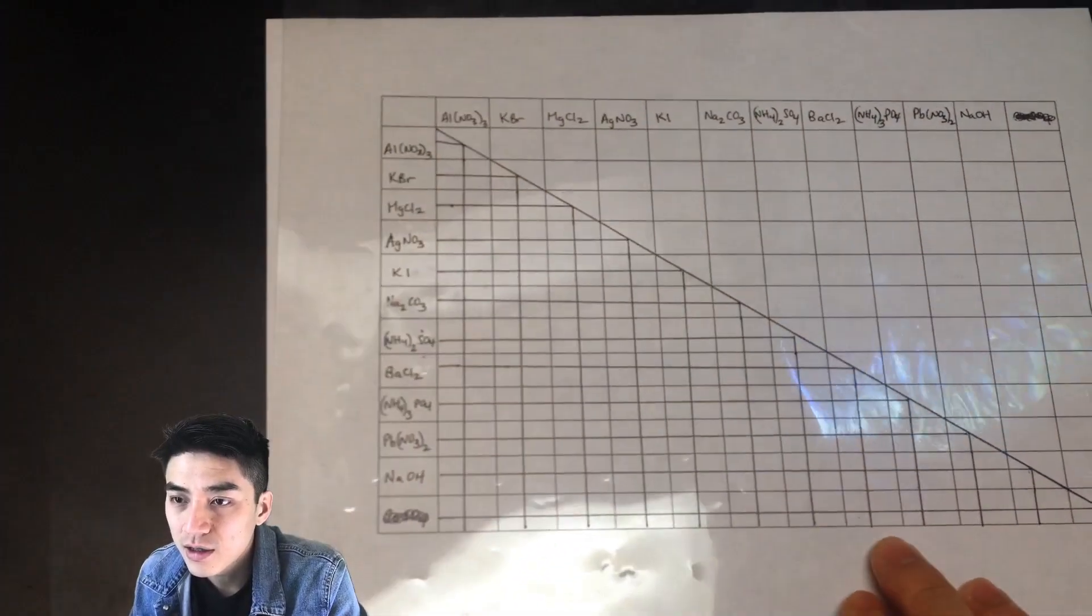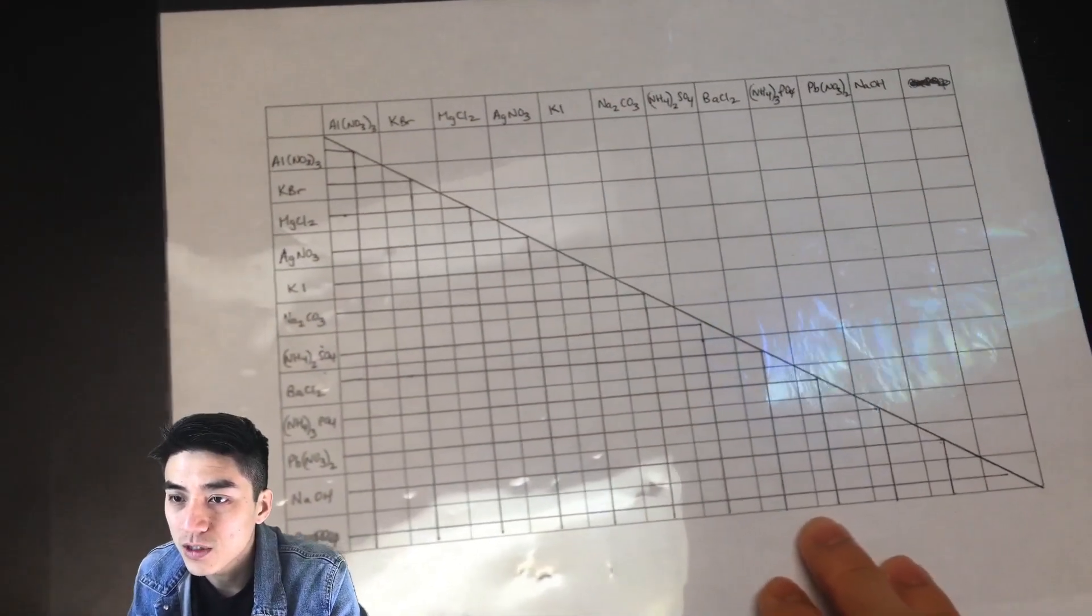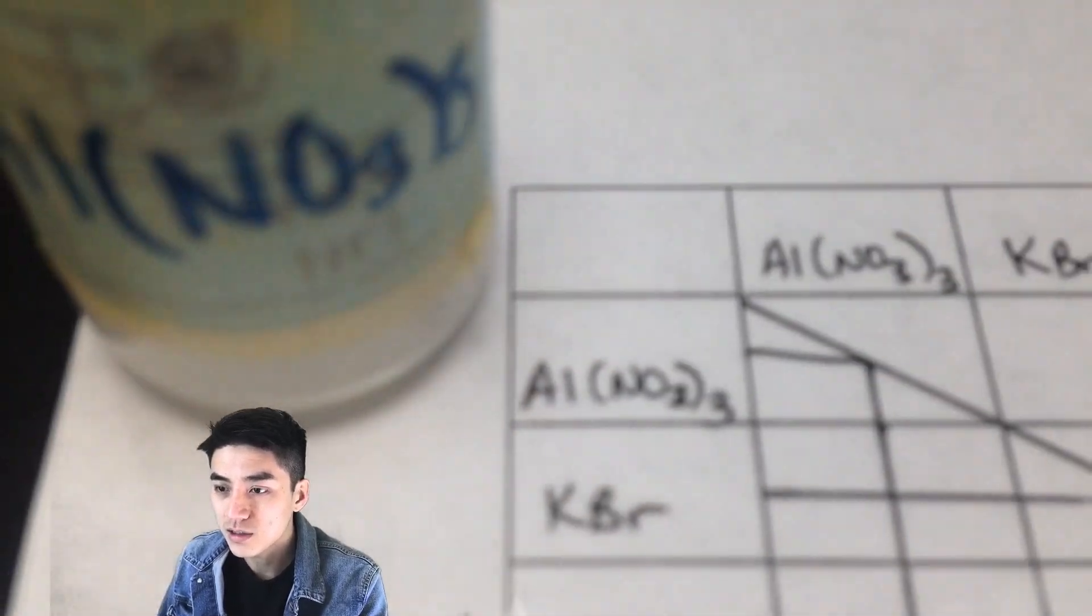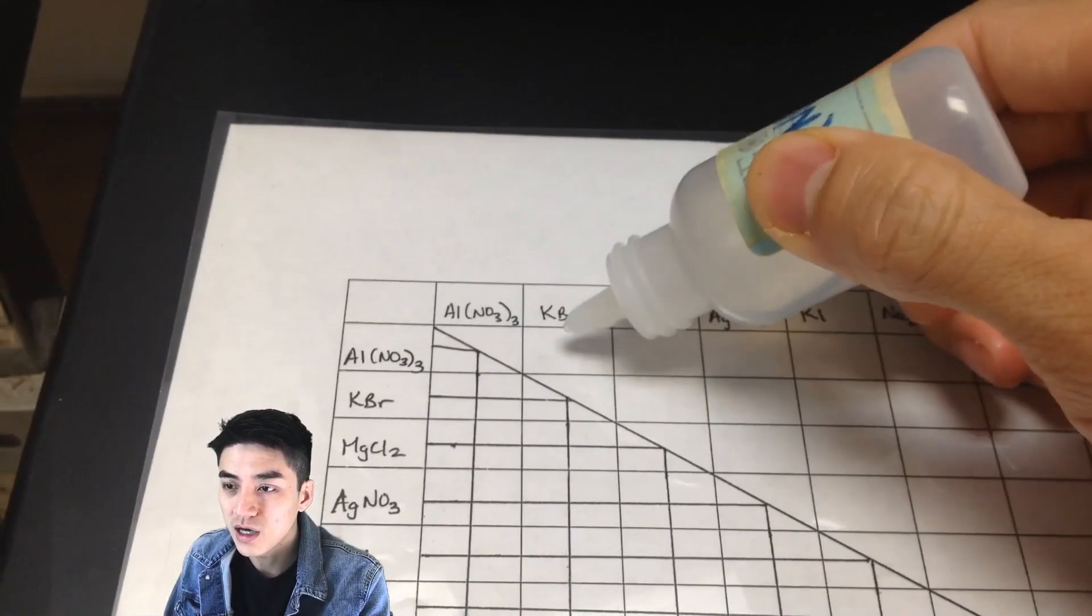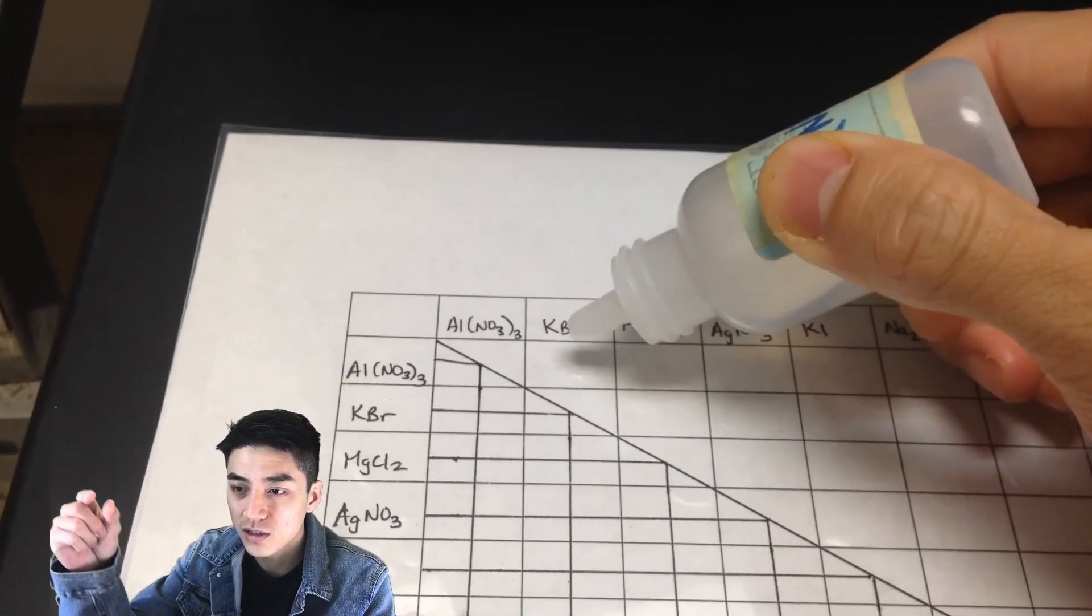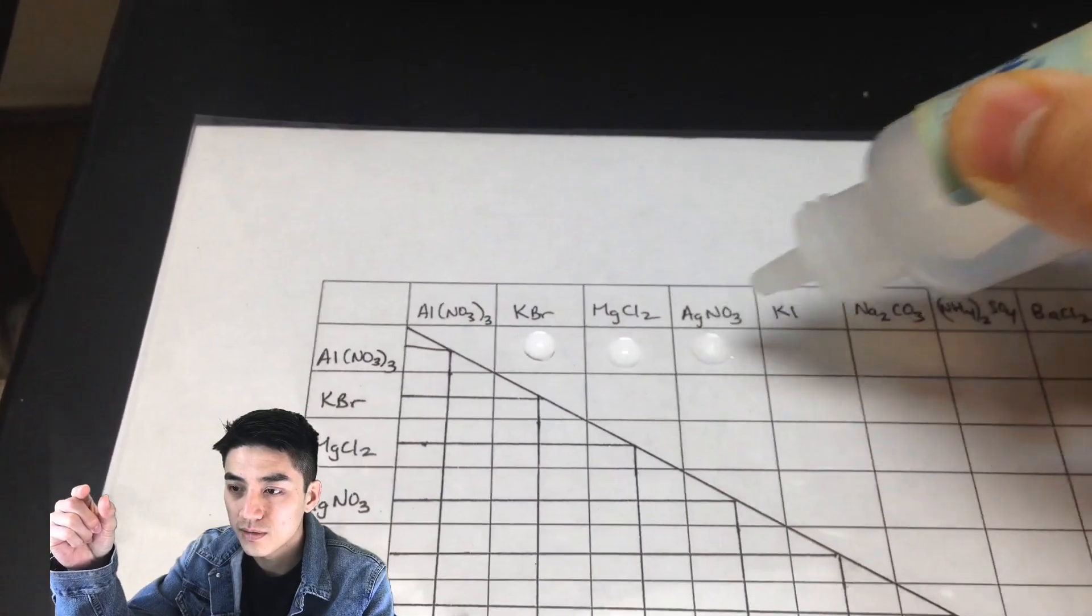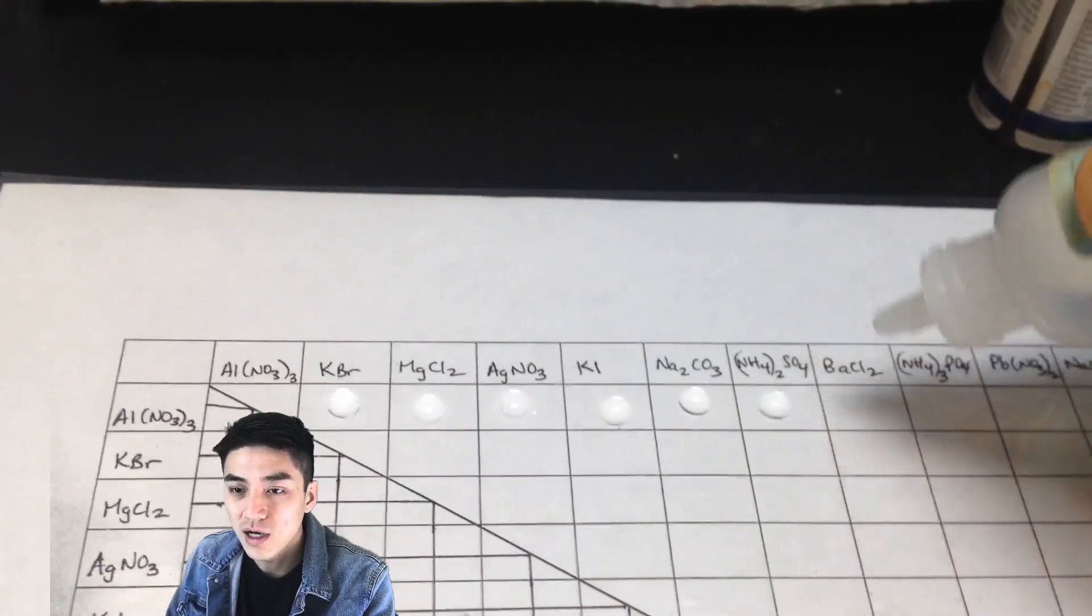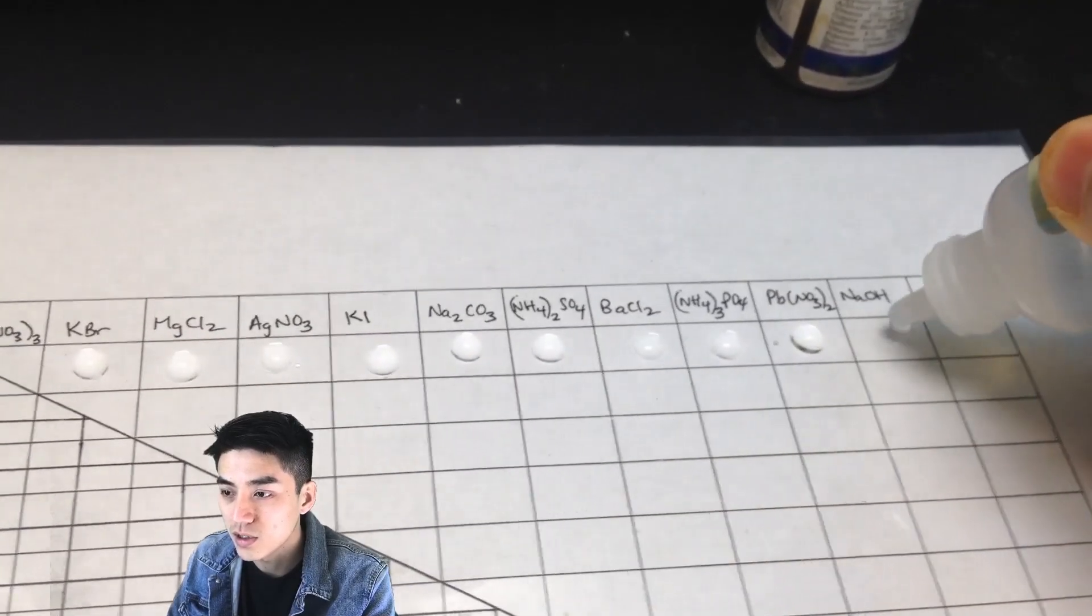This is how you're carrying out the reactions. We're going to use a transparency over some white paper. So we have our chemicals and the easiest way to do this is you just go row by row and then column by column. So I find my aluminum nitrate and then I just put drops in there, just go all the way across drop drop drop, so I just have one drop of aluminum nitrate just waiting in the rows.